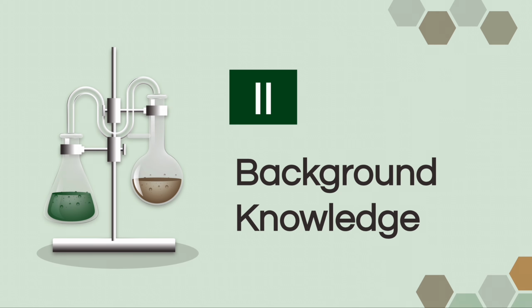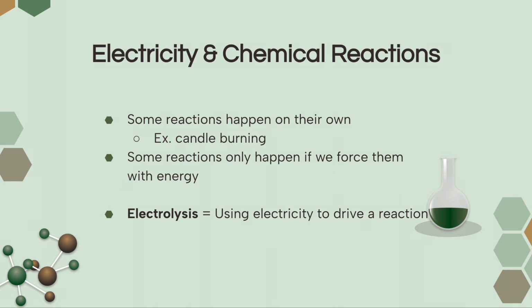Okay, now I'll go into background knowledge. Let's start with the big picture. Some reactions happen naturally, for example, a candle burning, but some reactions only happen if we give them extra energy. And electrolysis is when we use electricity as that energy source to drive a chemical change.